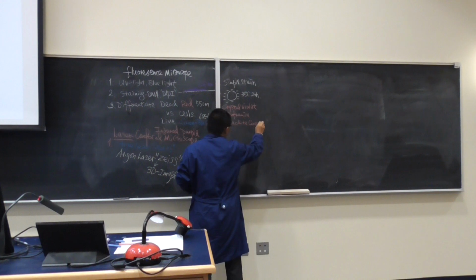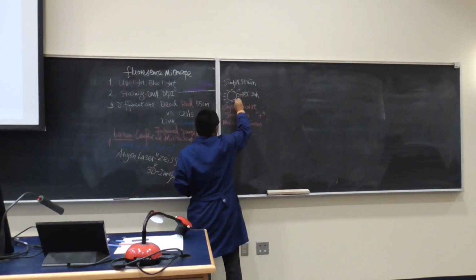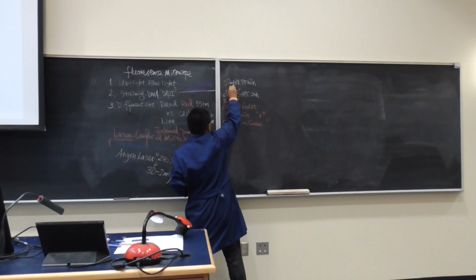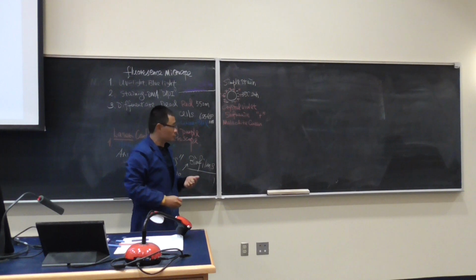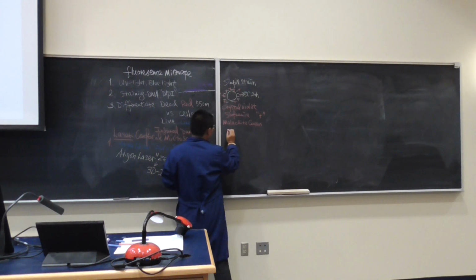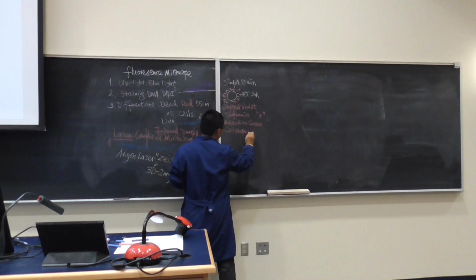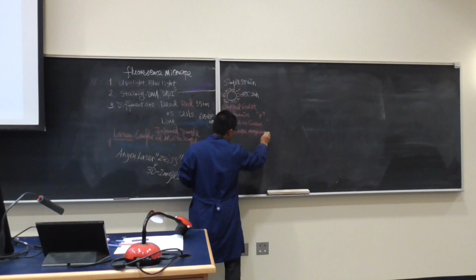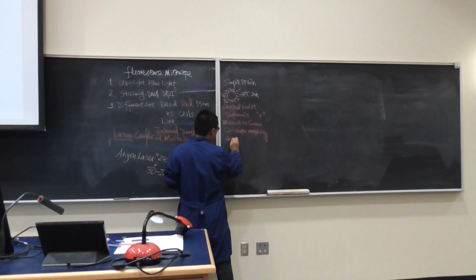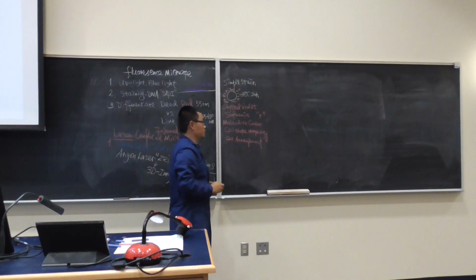Those are positively charged, so they could stack together and show up the color. And the important thing for the simple stain, we want to see the cell shape, which means the morphology, and we also want to see the cell arrangement. That's the purpose of the simple stain.